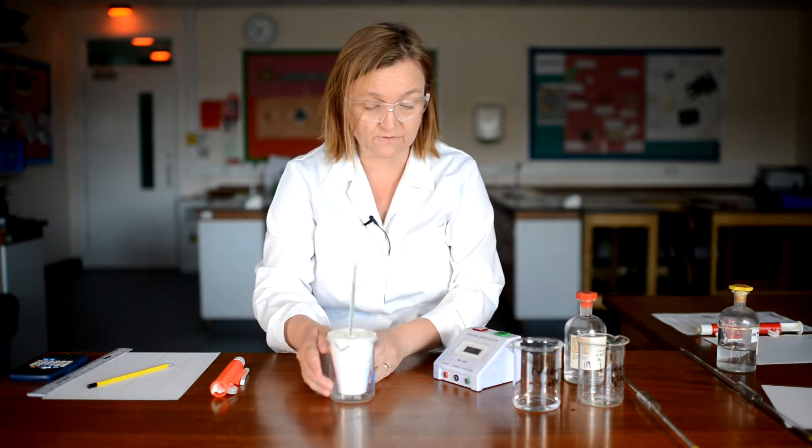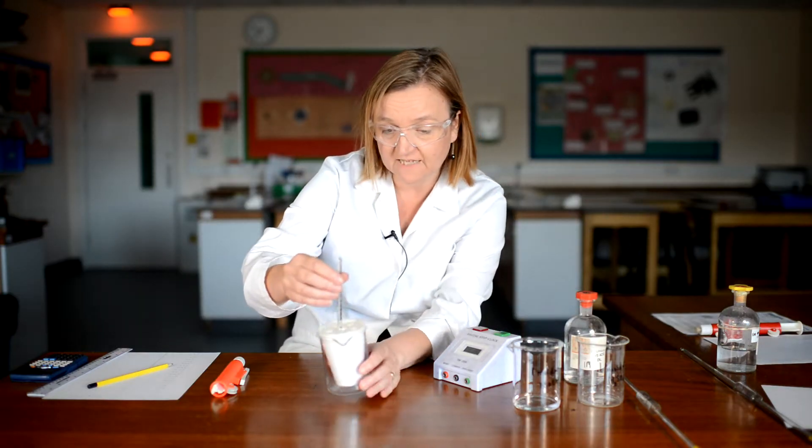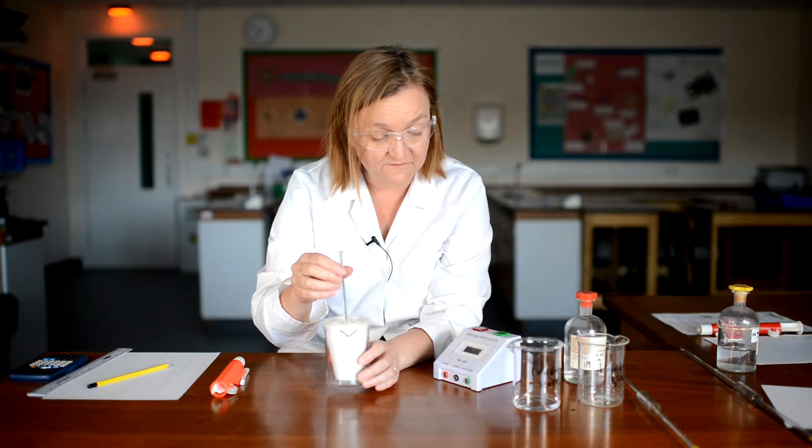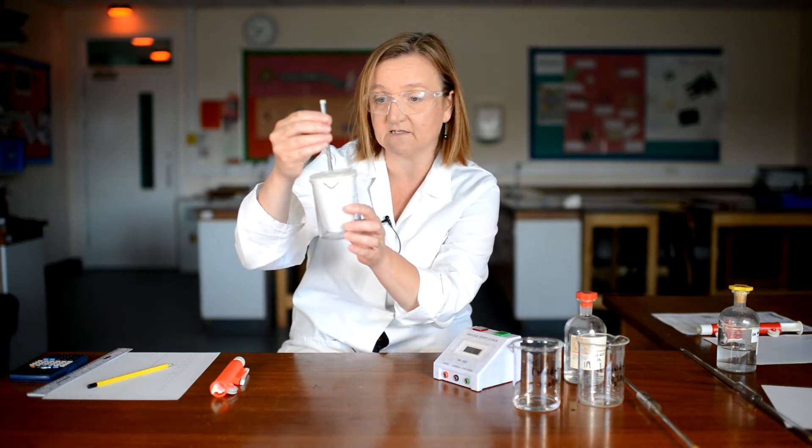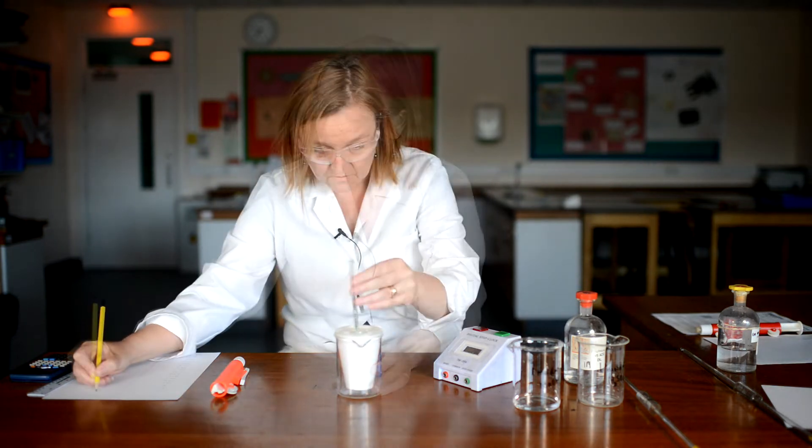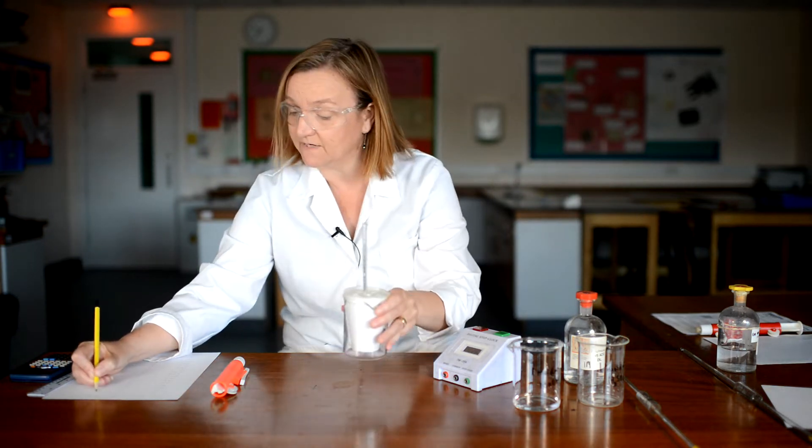Because what I'm going to do is I'm going to take the temperature every 30 seconds for three minutes. So as it comes up to the first measurement, I check the temperature and it's quite warm in here today and it's 24 degrees. So as soon as we get to 30 seconds, I will write down that into my table. So yeah, 24 degrees.